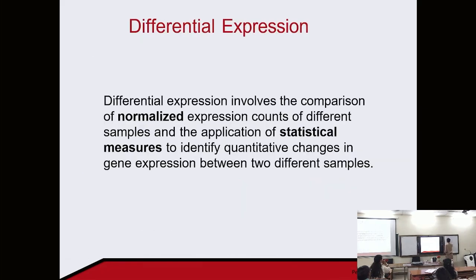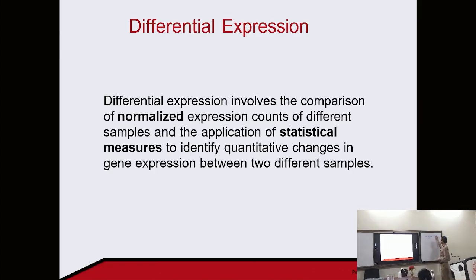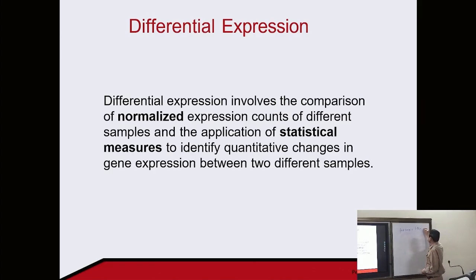fold change is the normalized count, and let's say the normalized count is FPKM or RPKM. Okay, so FPKM of condition, and let's say condition is some disease.